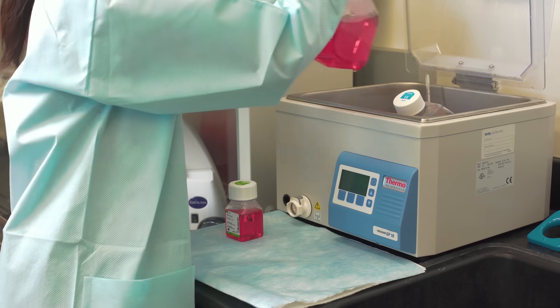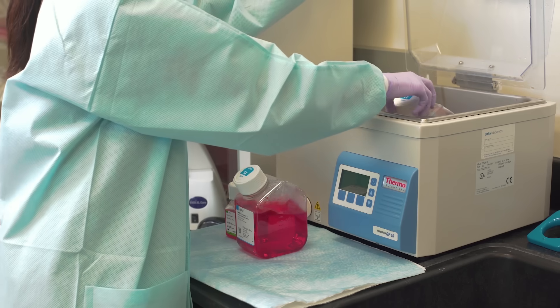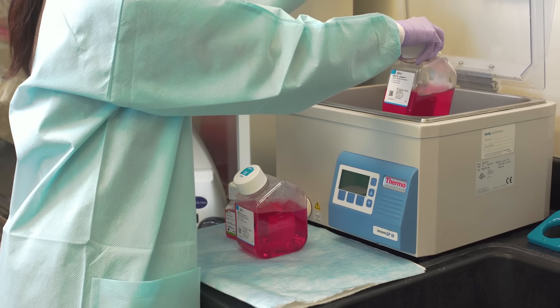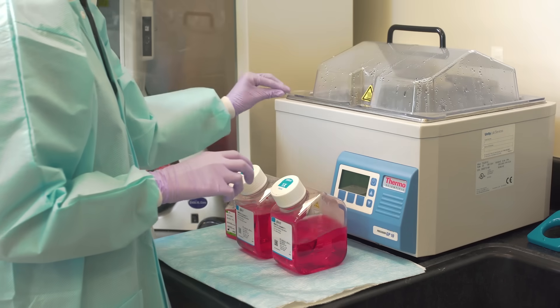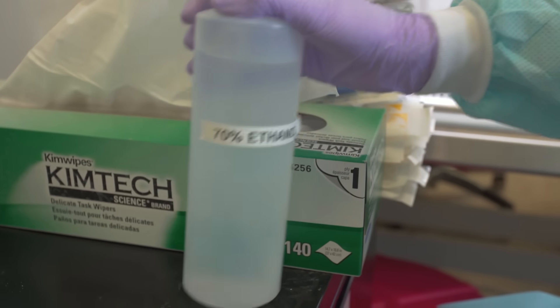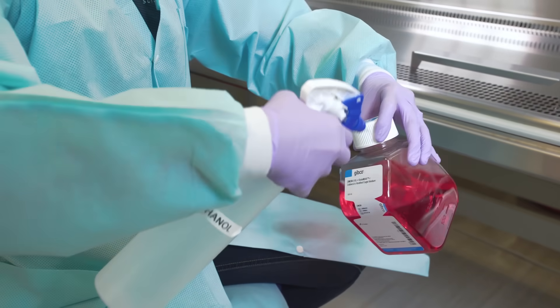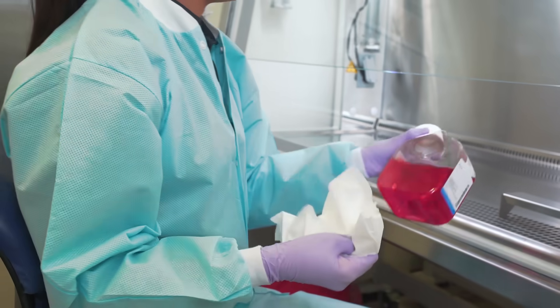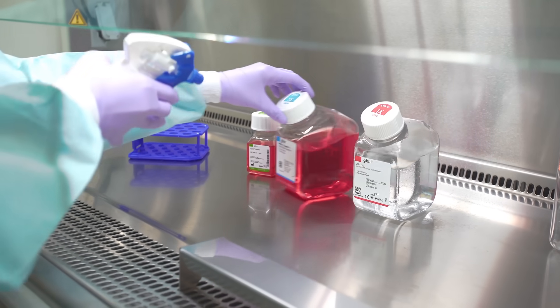Never leave reagents in the water bath longer than necessary. Excessive warming can lead to L-glutamine degradation and loss of activity in trypsin solutions. Gibco GlutaMAX and TrypLE are more stable versions of L-glutamine and trypsin. Remember to clean each item placed in the hood with ethanol. You may choose to spray the item before placing it in the hood or immediately after, as demonstrated.